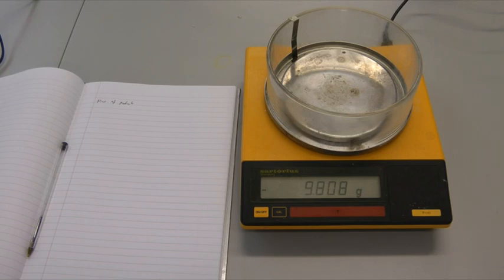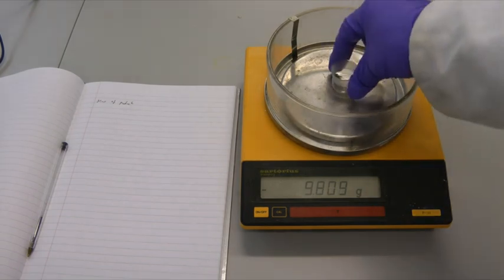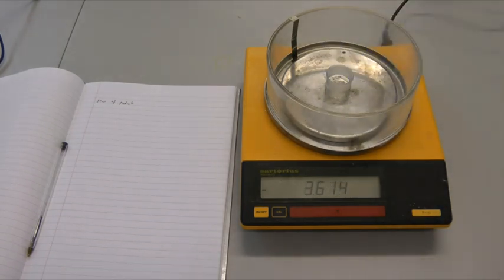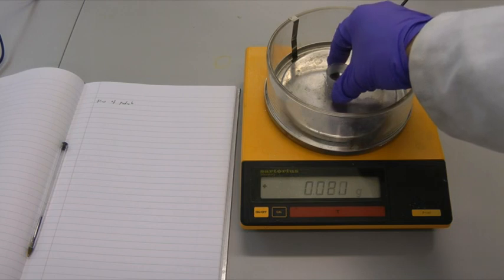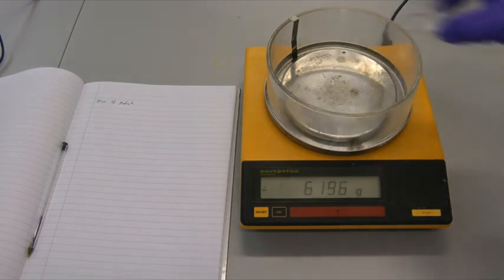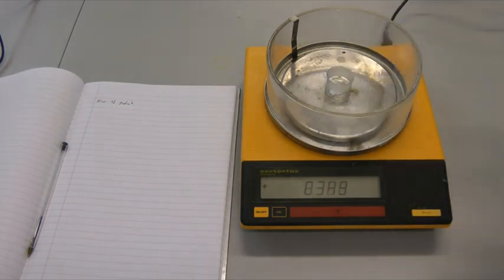Sometimes you might want to work out the mass of product from a chemical reaction. As above, the balance should first be tared with a weighing boat or other container in place. This can then be removed and the product transferred before re-weighing. The mass obtained should then be recorded accurately.